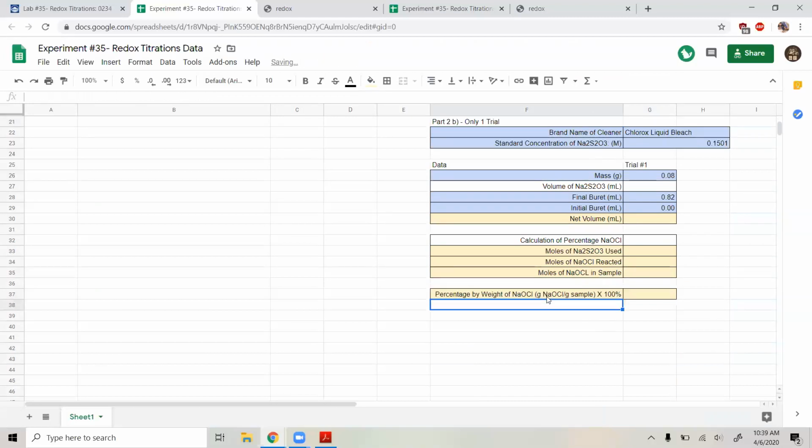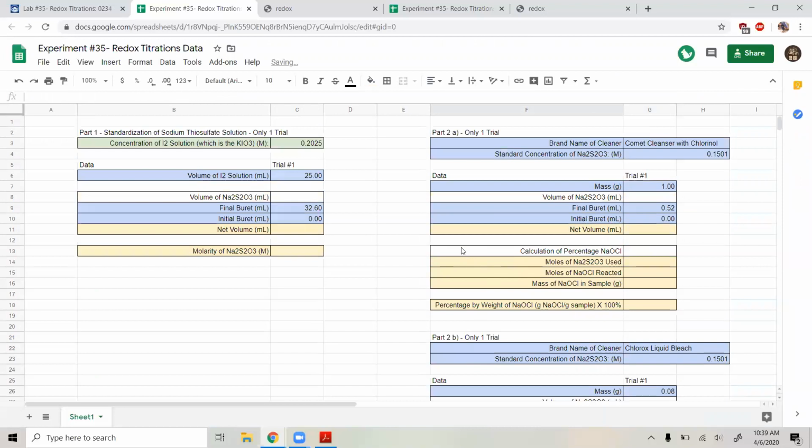Now, I'm going to show you something. I've created my own spreadsheet for that way for us to work on. But you can also use the same thing that I'm doing. The only thing is you can't make any edits on this spreadsheet itself.